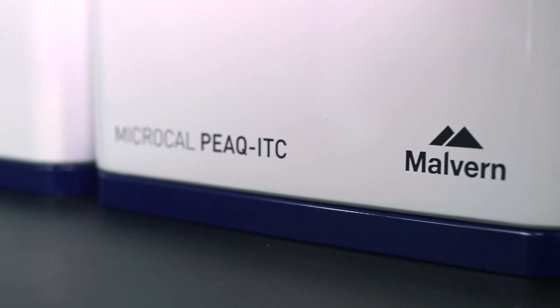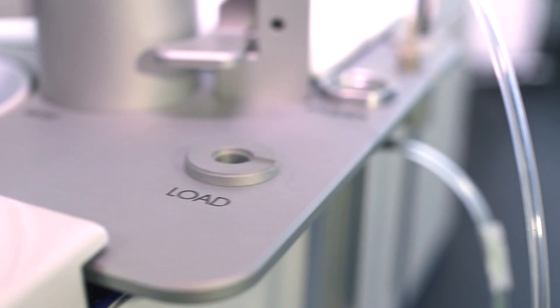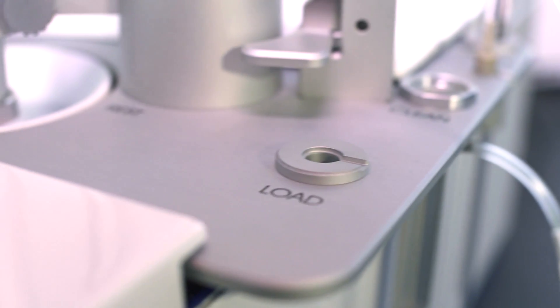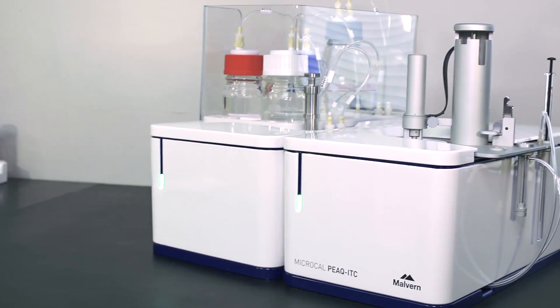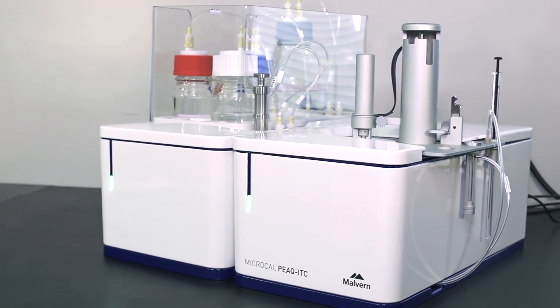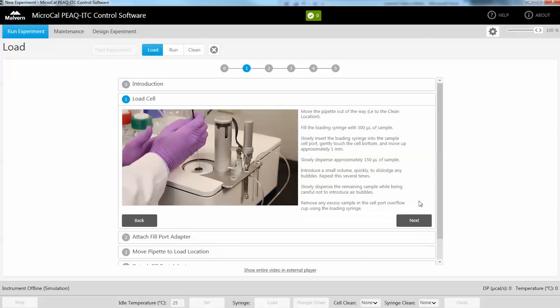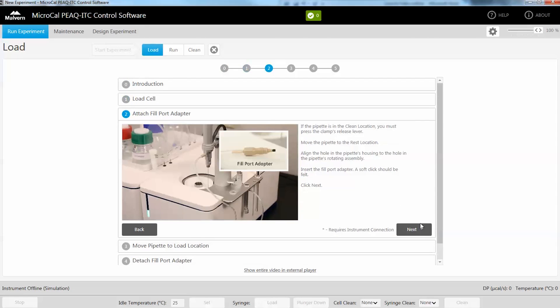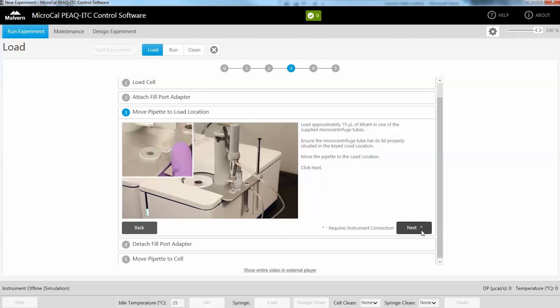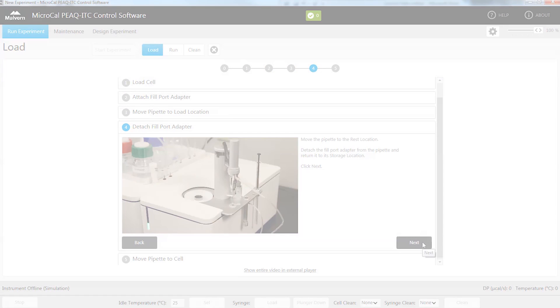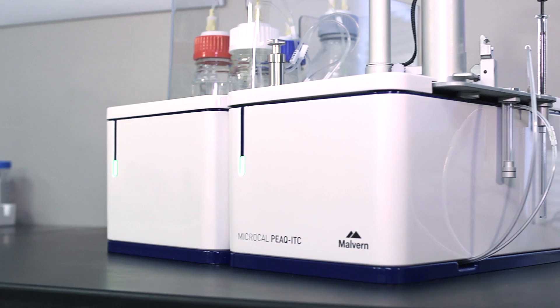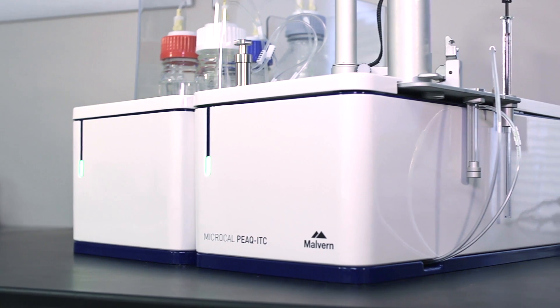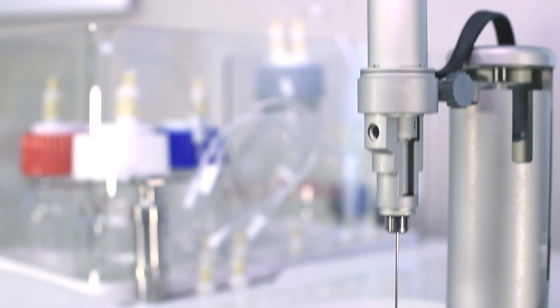MicroCal PEAQ-ITC from Malvern Instruments delivers exceptional sensitivity and high quality data with low sample consumption. Our user-friendly guided workflows with embedded help videos give any level of user the ability to generate high quality data. MicroCal PEAQ-ITC is designed for ease of use and exceptional sensitivity.